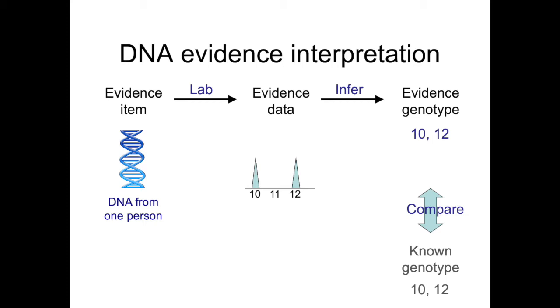And then they detect them by separating them by size, so that the longer fragments you'll see on the right of a picture, like a 12, will be to the right of a 10, which will be to the right of a 5. That's what the DNA sequencers do. They separate by size. So it's very fancy technology. Long talks on it you won't hear from me today about lasers and CCD cameras and separating machines, robots. It's fantastic. In the end, you get what you see in the middle. It's a cartoon version. That's your data.